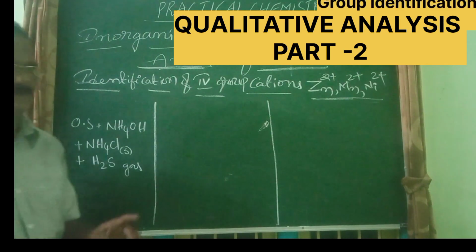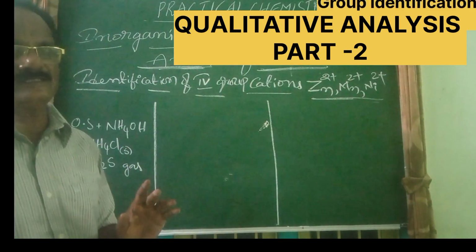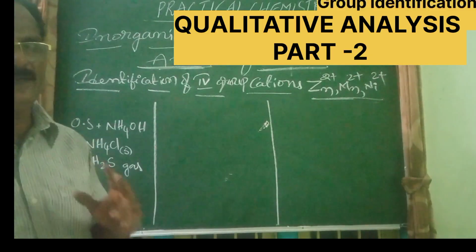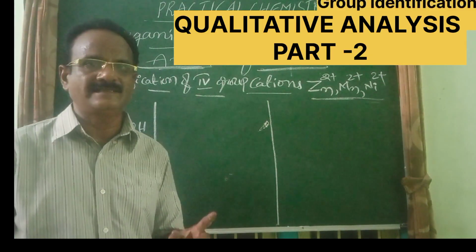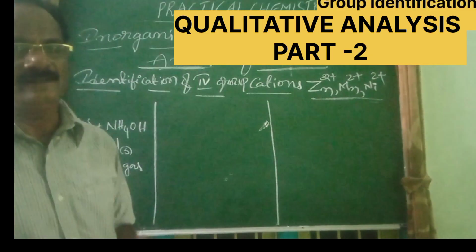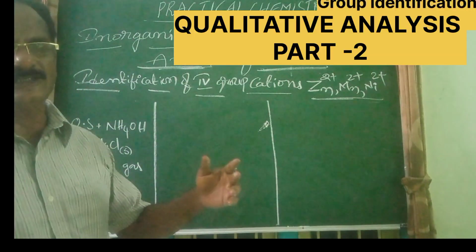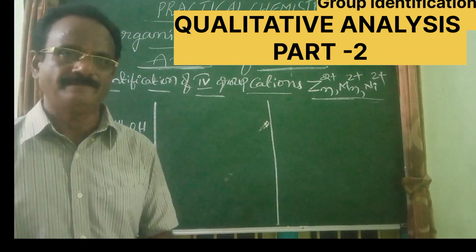Keep in mind, during identification of second group cations, we have added HCl and then H2S. So there we have taken H2S in acidic medium.